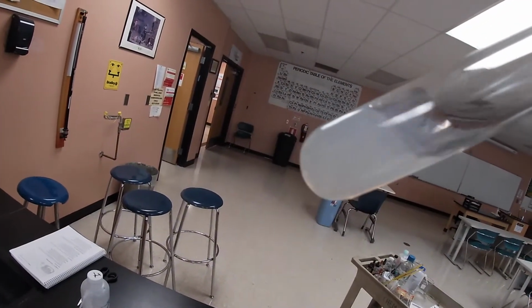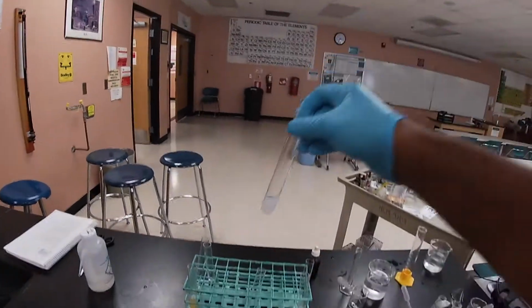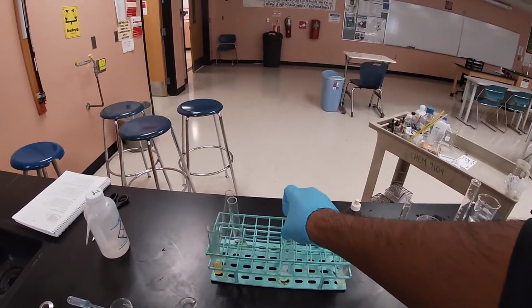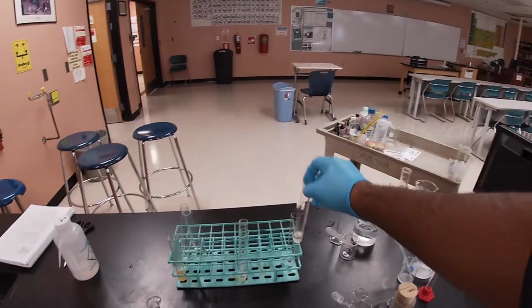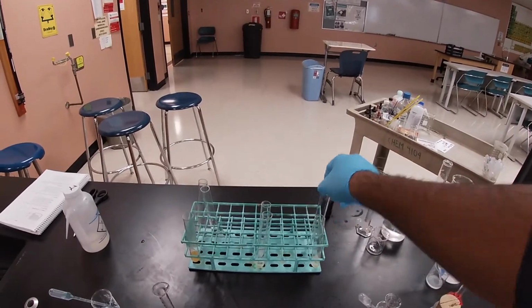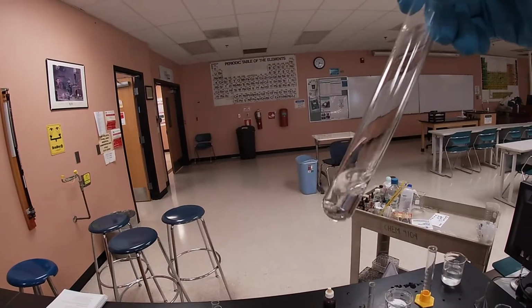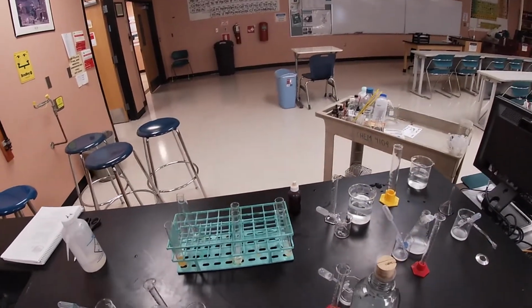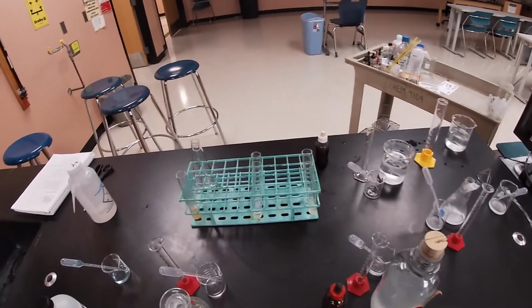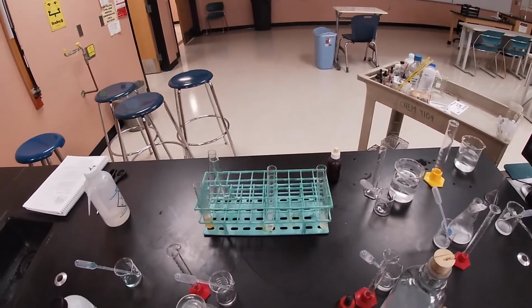And then for our silver nitrate addition, it did get cloudy, as you can see right there. Nice and cloudy. So maybe some sodium, some chloride ion went through. And then of course, our starch solution, when we added it in, we did not see any blue, right? So the starch did not go through, nor the glucose in the dialysis paper.